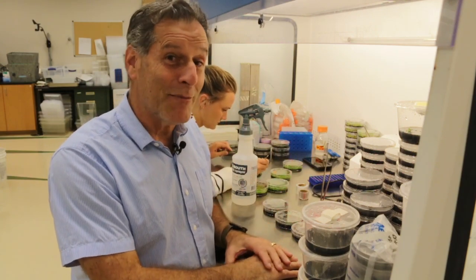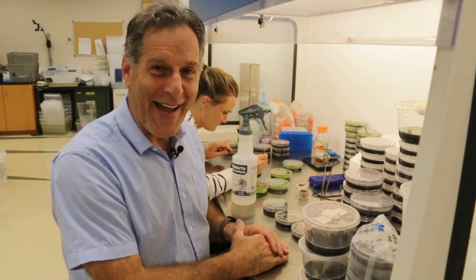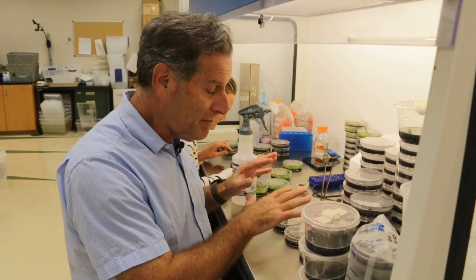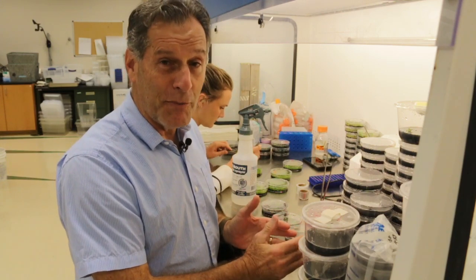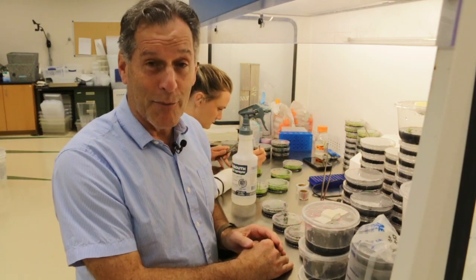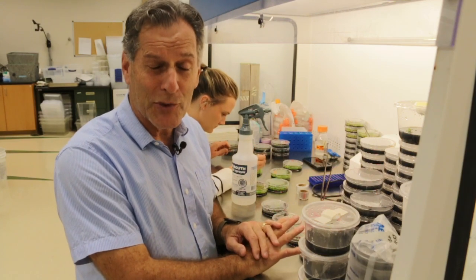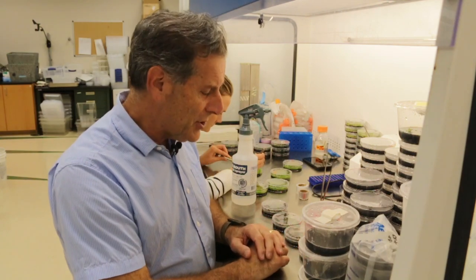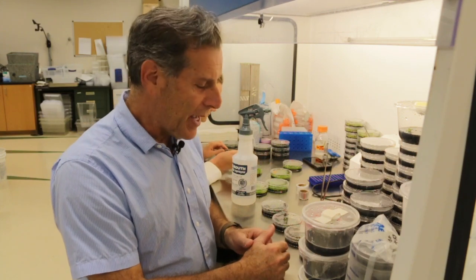I wanted to share some non-orchid things with you. There are orchids being done behind me, but what I want to share with you are some results with a different group of plants. This is a foray, a venture into carnivorous plants.